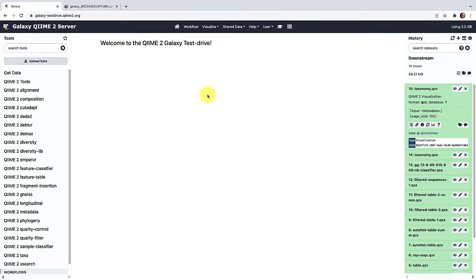For this step, we're going to be filtering our data based on the taxonomy that we just generated. By filtering using our taxonomy, we can remove non-targeted sequences as well as those with less informational content. There are several criteria we'll be using to filter based on our taxonomy. The first is a common step in 16S analyses — we'll be removing sequences that cannot be assigned to at least the phylum level. We'll also be filtering out any sequences that have an annotation containing either chloroplast or mitochondria, because these are eukaryotic organelle 16S sequences that we are not interested in in our study.